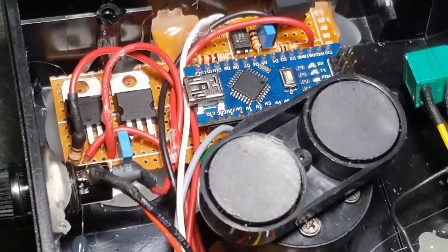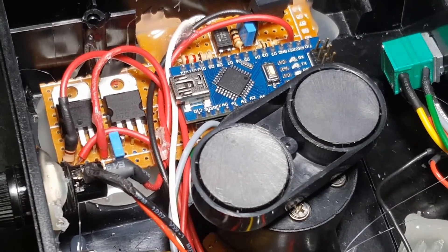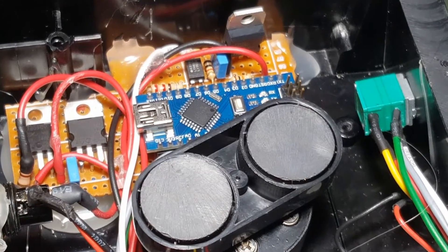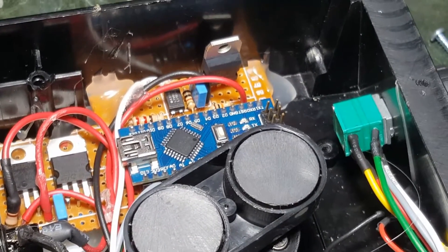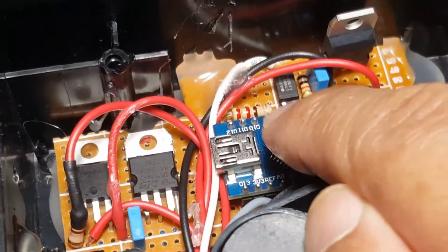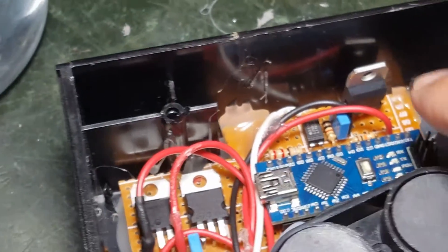It is a very simple circuit. It steps down the voltage from 12V to 5V, then hooks up with the Arduino Nano with simple programming. It drives an optocoupler, and from the optocoupler it drives a power transistor, which in turn drives the DC motor.